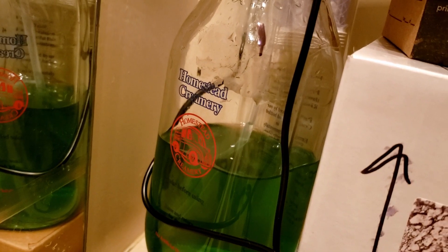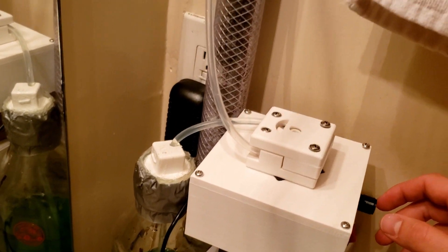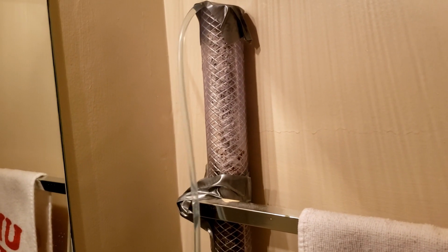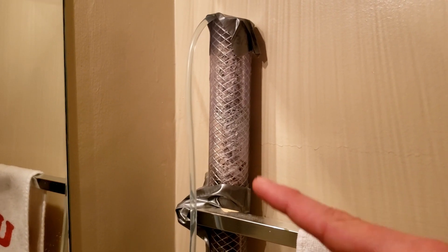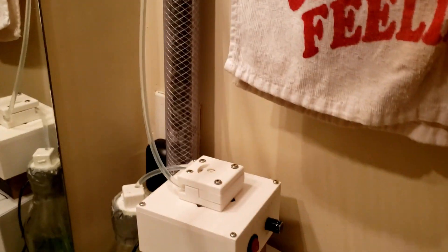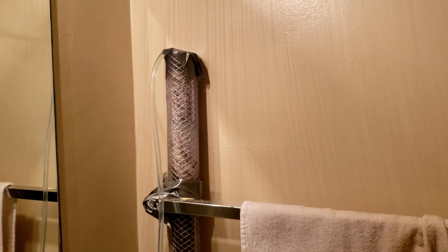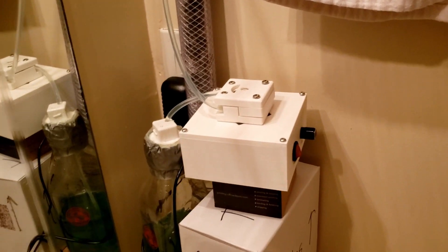Let's turn this on. There it goes — let's see if it can pull up the liquid. I'm going to turn it up — there it goes! I sterilized the tube with isopropyl alcohol too. I'm going to slow it down now. You can see the liquid in there — that's working. I might come in and adjust the pump every now and then, but as long as it's flowing, I think it's fine. We'll see what it looks like coming out the other side — I think that will be the most interesting part.